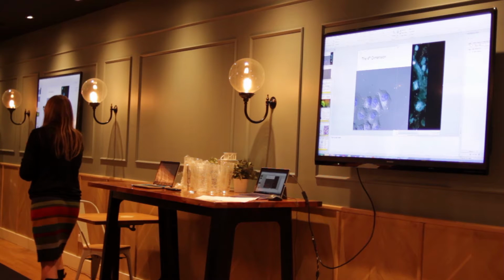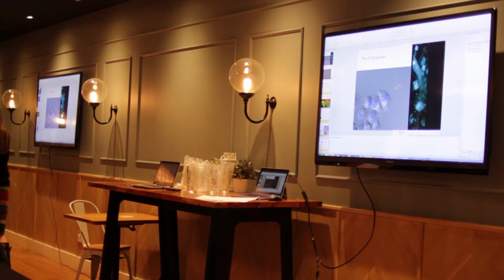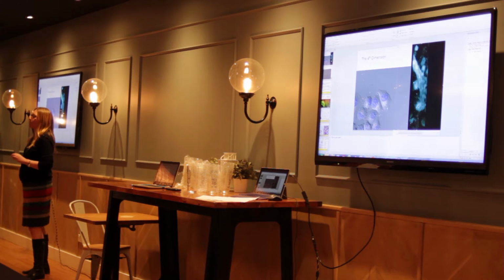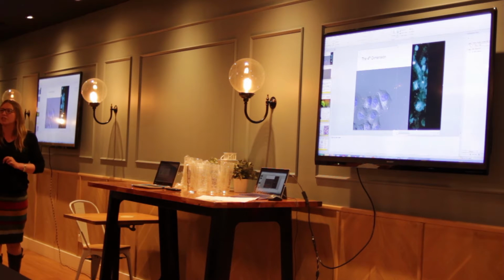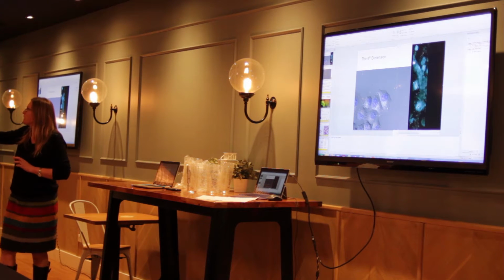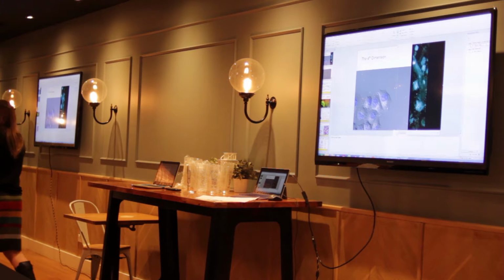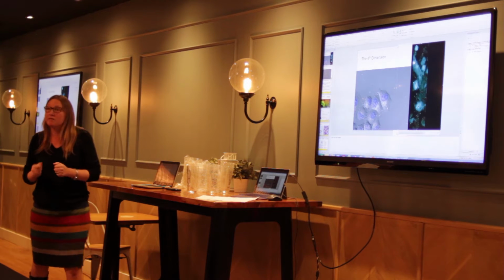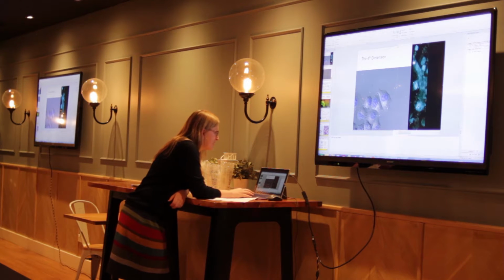Those are neurons. What we're actually looking at there is the calcium process as they actually talk to one another. This means that you've got an image in the order of about 200 frames per second. When you're watching a DVD, 30 frames per second. Okay? We have cameras on some of our microscopes that can take 22,000 frames per second. That's pretty cool. It's not a lot of light around there, so it's a bit of a balance. But yes, can we go that fast? Yes, we can. And the sort of processes we can see at that time are very different. Again, about perspective.